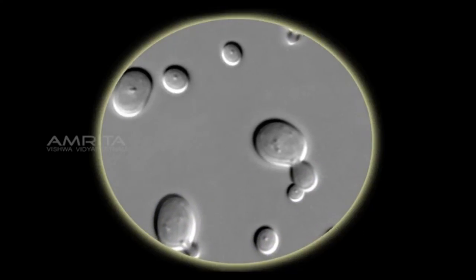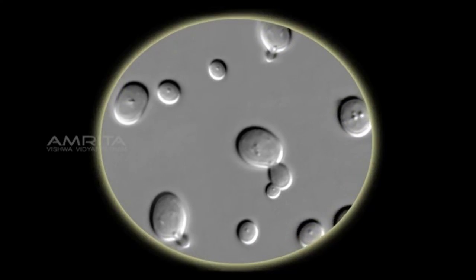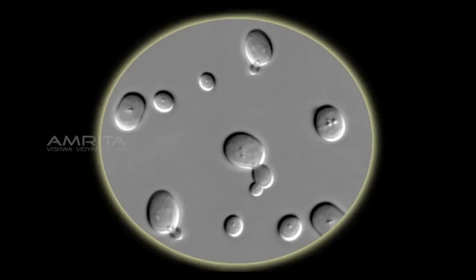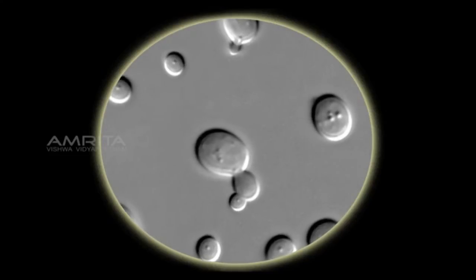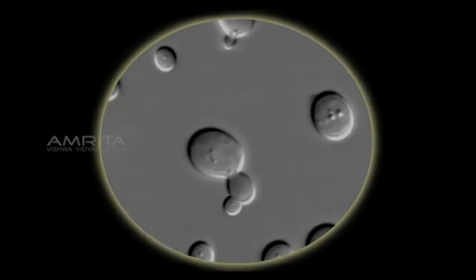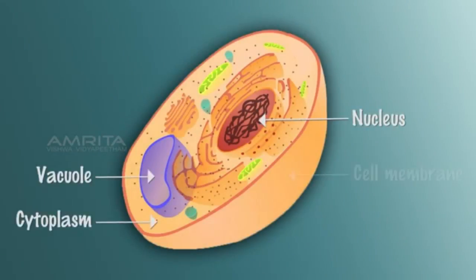We can also see the nucleus of the parent cell that splits into a daughter nucleus and migrates into each outgrowth. The bud detaches from the mother's body by forming a constriction at the base, which can be observed. A yeast cell has a nucleus, vacuole, cytoplasm, and a cell membrane.